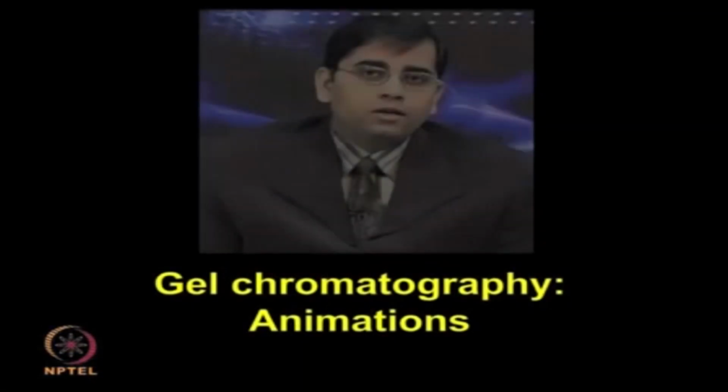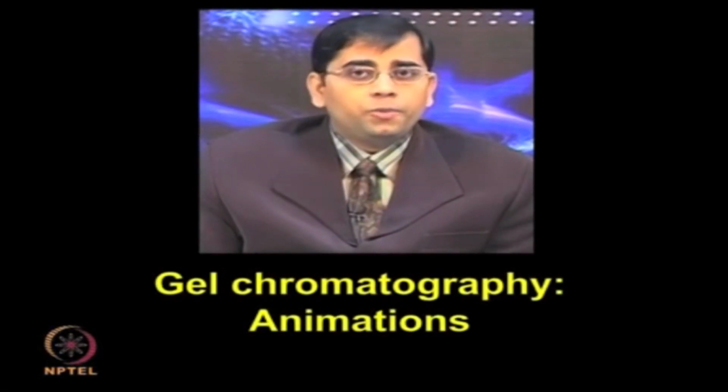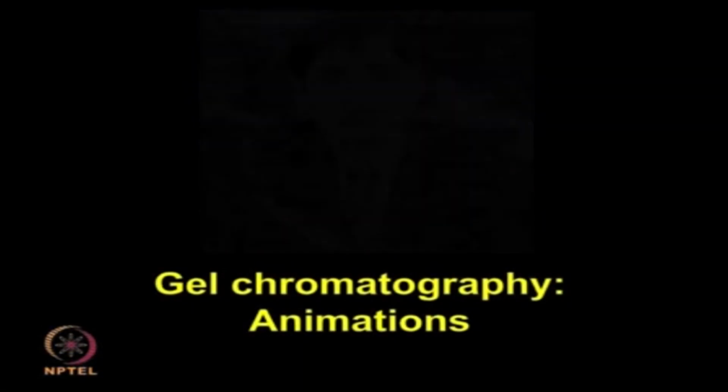So, gel filtration chromatography is useful for removal of contaminants, desalting steps, as well as for buffer exchange. However, its drawbacks are its low capacity, broad distribution of pore size and small sample volumes to be analyzed. So, let me describe the gel chromatography technique in the following animation.